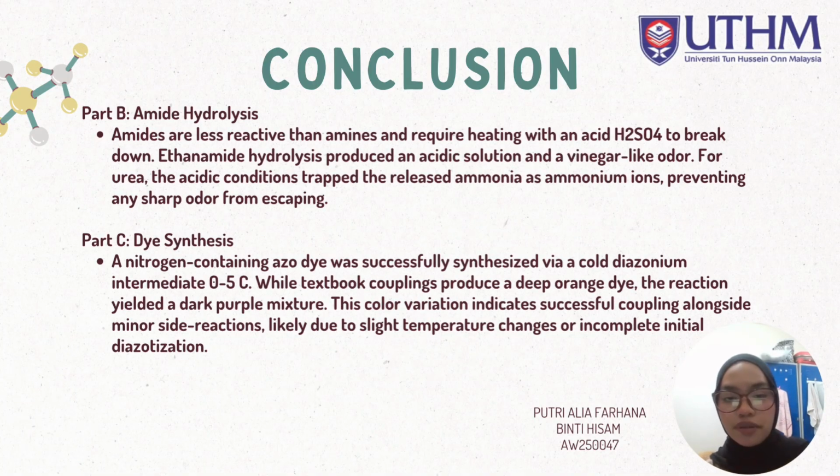For part B, amide hydrolysis. The conclusion is that amides are less reactive than amines and require heating with H2SO4 to break down. Ethanamide hydrolysis produces an acidic solution and a vinegar-like odor. For urea, the acidic condition traps the released ammonia as ammonium ions, preventing any sharp odor from escaping.